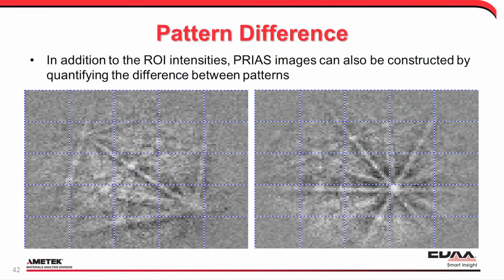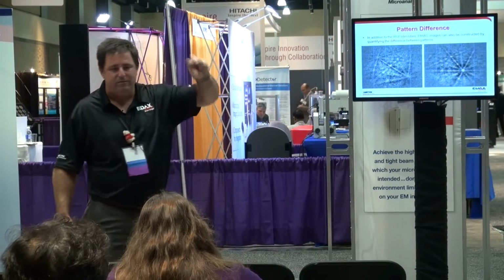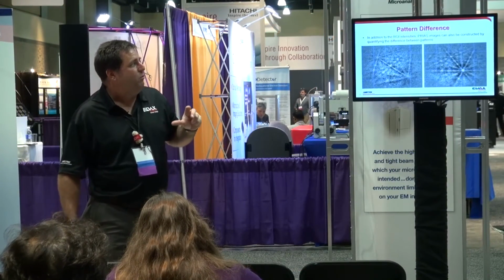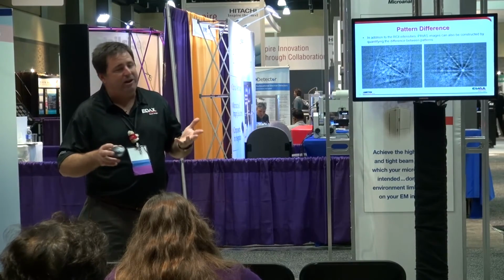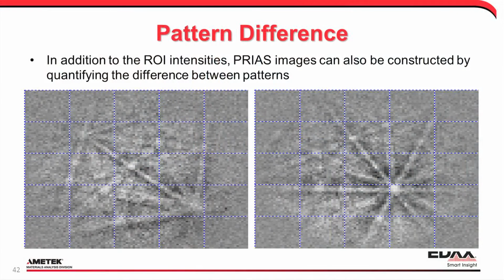That's kind of the imaging approach. And then the next step is to say, can we do more analytical imaging with this data? So here again, we have this 5x5 array of different signals. What we want to do is to say, can we tell between all of those when the pattern changes? And not just change from one to the other, but when does something change significantly that we'd say it's one orientation or the other, whatever our criteria is.